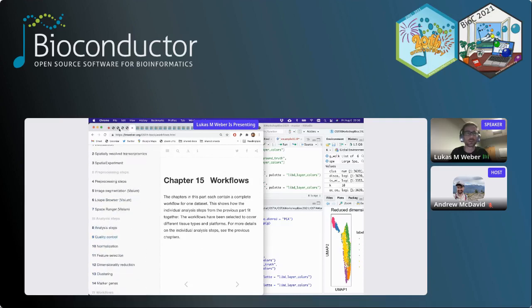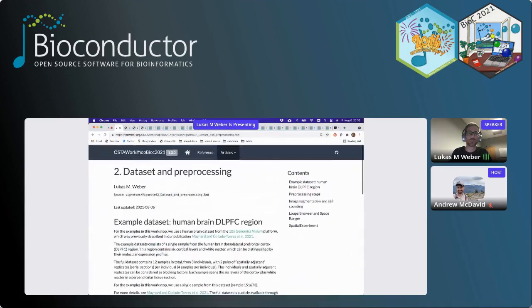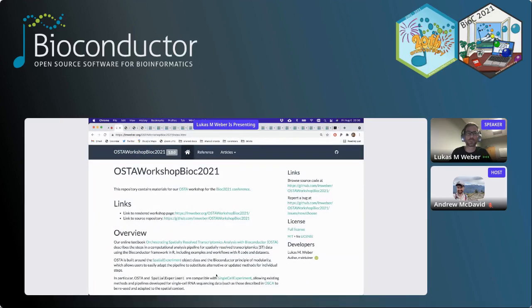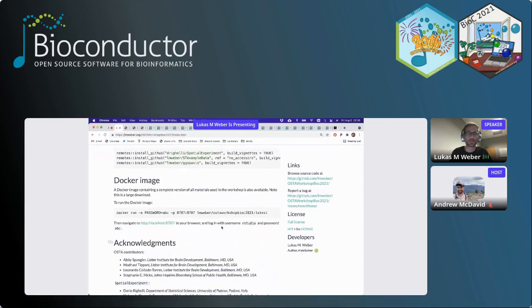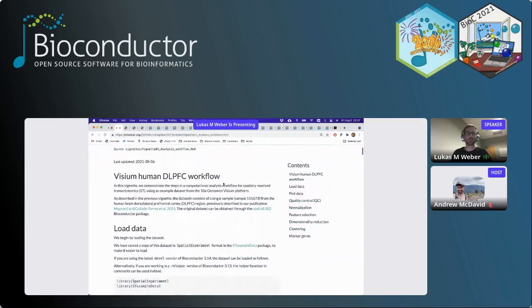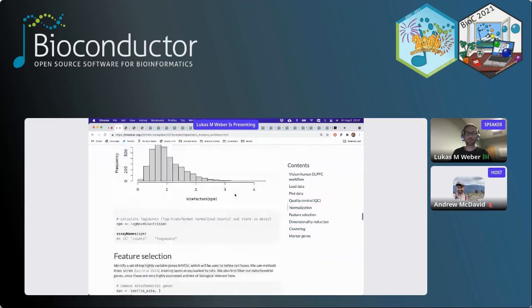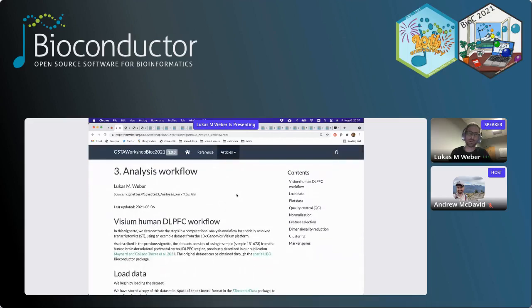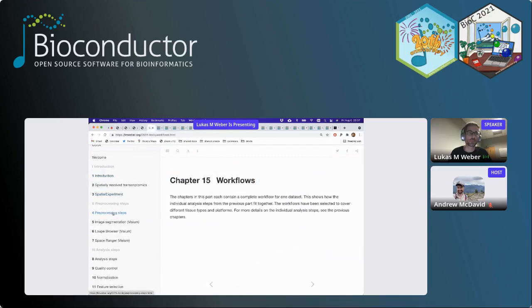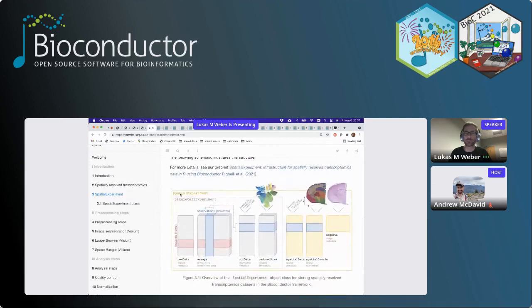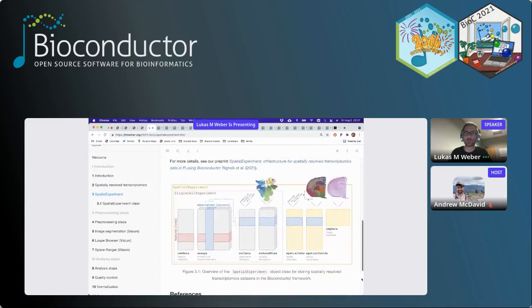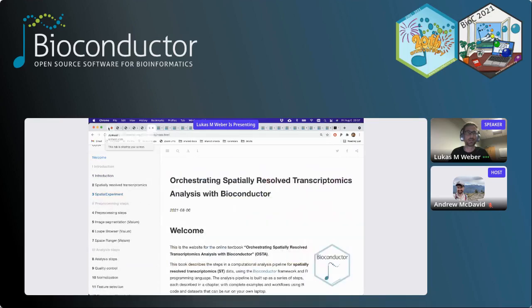We can show it in reduced dimension space with a different function called plot_dim_red in PCA space or UMAP space. There's another function called plot_visium which has more options for plotting on the Visium slide. In the future, we'll continue to expand this with methods developed more recently for the spatial context. The next chapter is on marker gene testing. I'll leave that in the interest of time. I'll go back to the workshop page. Here we had the initial workshop page with links, installations, and instructions.